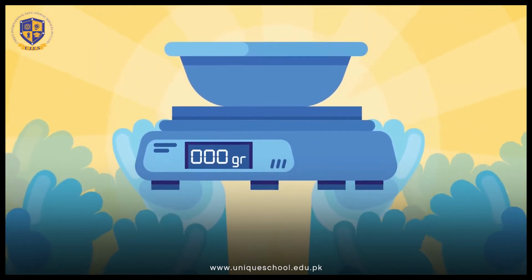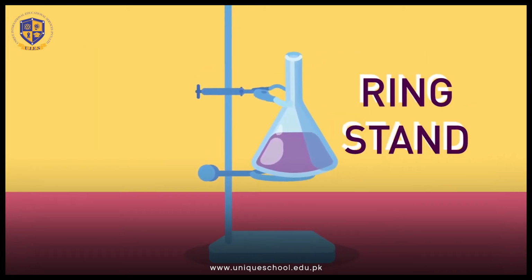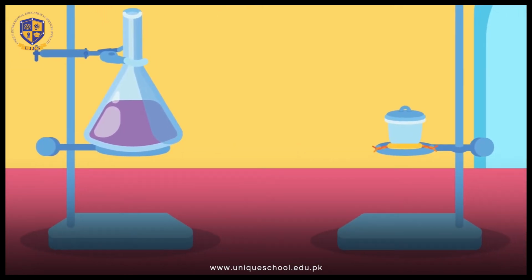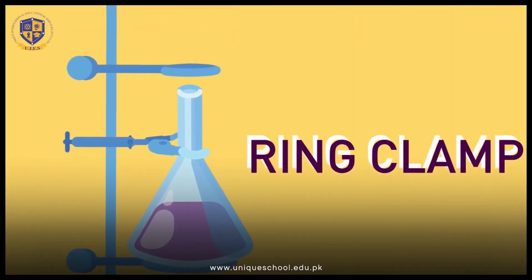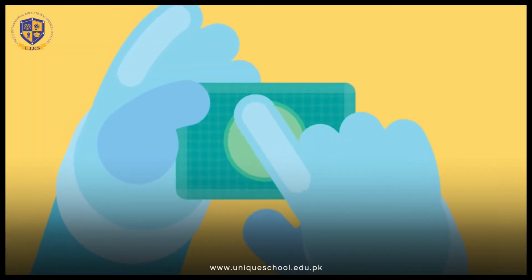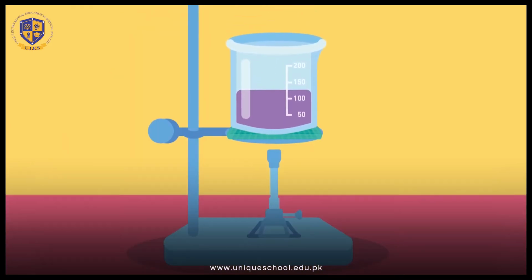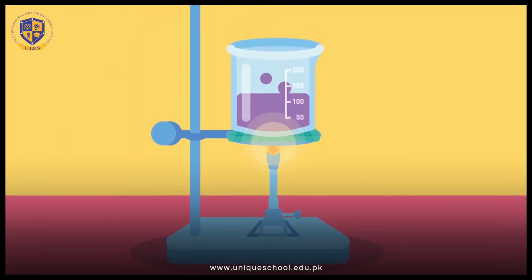in any laboratory. Ring stand, used as support to clamp laboratory glassware and other equipment in place, so it does not fall down or come apart. Ring clamp, used with a ring stand to hold glassware such as a beaker or a funnel. Wire gauze, may have a fiberglass or ceramic center, used to support a container such as a beaker on a ring stand while it is being heated.